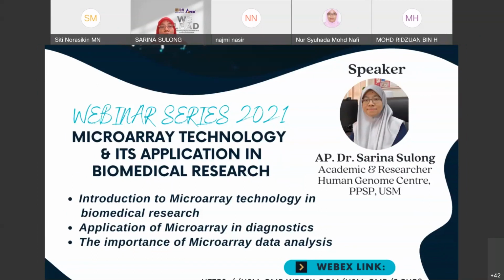And now our microarray is not cost effective to repair because it no longer functions. So we hope that in the future we can replace our microarray with a new system or a new model of microarray, if we want to proceed with microarray. But of course, you can still outsource if you want to use microarray, and the important step later on is the data analysis. You have to understand your data. If not, because the data is very huge and there are a lot of things you can do with the data from the genomic approach. All right, thank you.